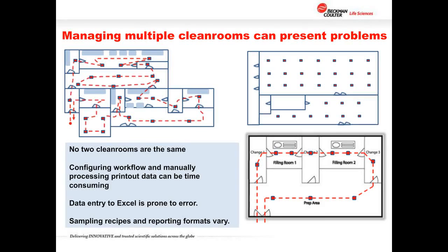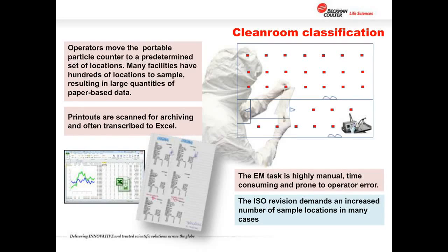First off, of course, is orchestrating the flow in an effective way and being able maybe to incorporate that into the instrument so it's a planned movement to make that more efficient in the process of moving through the various 9 points that are there under the new system, and maybe figuring out a way to minimize the reporting side of it. You're still going to have to go out and sample at each and every point. The demand then, of course, at the end is I have to create a report and file information. Can we speed that up?